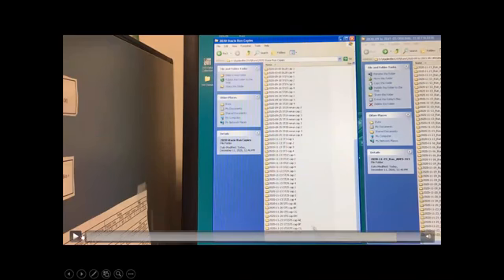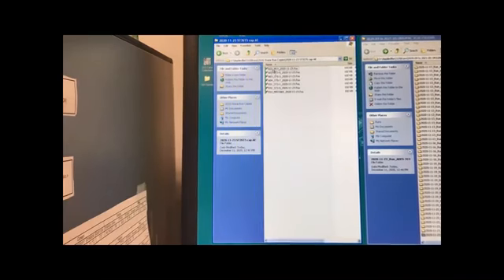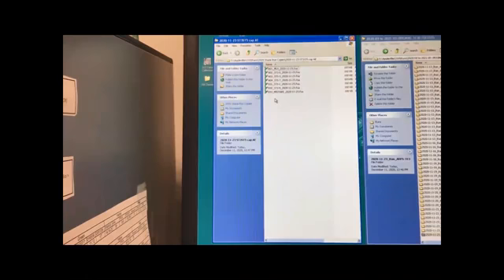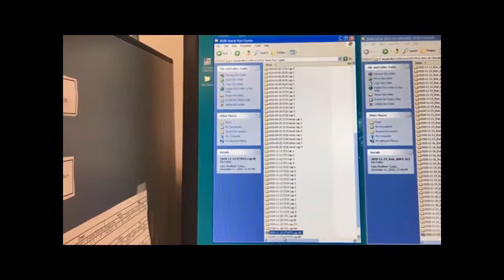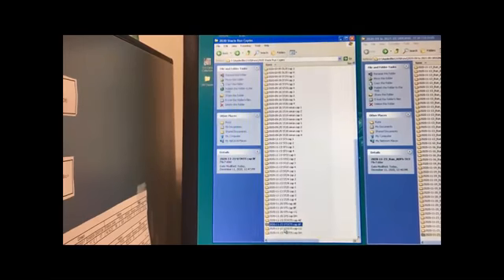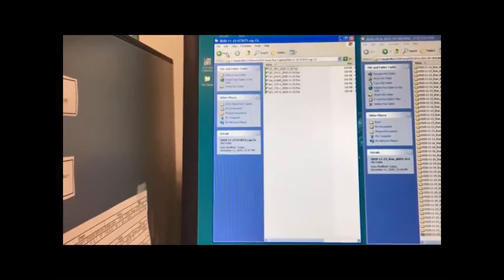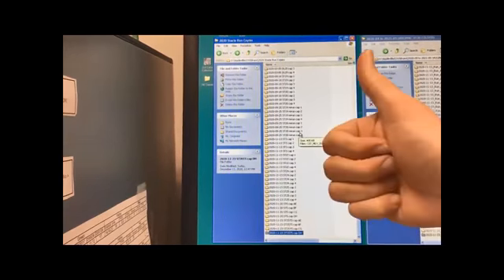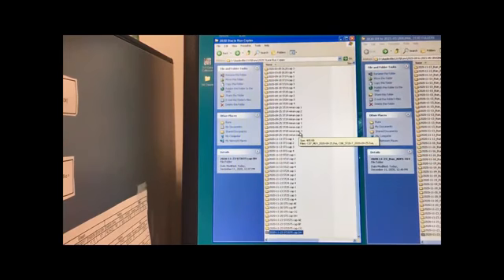Do I have another video here as far as how to get them into Genemapper software? Yeah, I just show you what it looks like. Okay, there's all your A's and E's. So what will happen is when you import these into Genemapper software, you just select all 4 of those folders, and it's great because it brings them into Genemapper as 4 separate folders, and that's what the software needs because it needs one ladder in each of those folders. If you have 2 ladders, it gets messed up. If you don't have any ladders, you get an error message. Okay, so that is what it should look like after you get finished copying and pasting your files over.